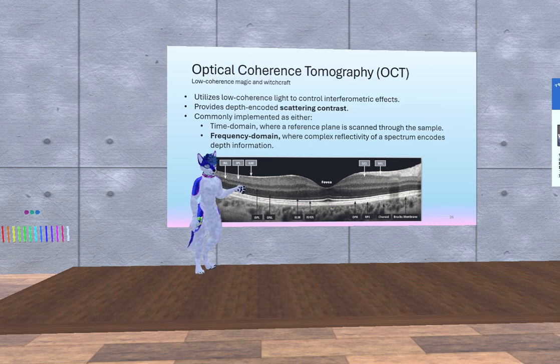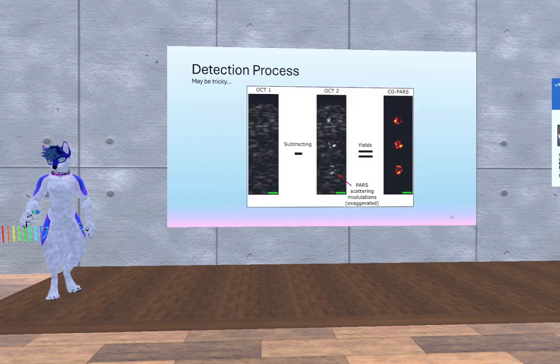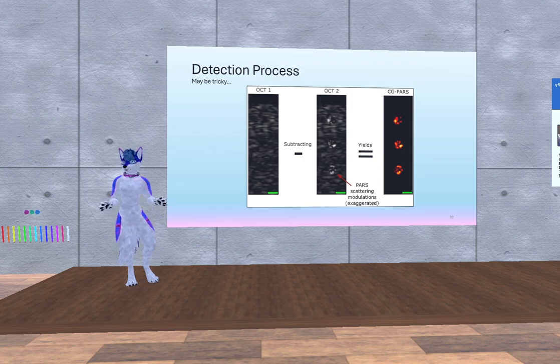Also, there are things that look like noise that aren't actually noise, and OCT is a great example of that. That's speckle. You can even see that in some of these simulations where you have this background. This is not noise. This is speckle. This is a consequence of the fact that you're doing interferometry and you're looking, in this case, at the real component of that interferometric result, right? It's not noise. But you can imagine in a real imaging system, you'd have this and you'd have noise on top of it. And so it gets really complicated really quickly to try to separate those things.